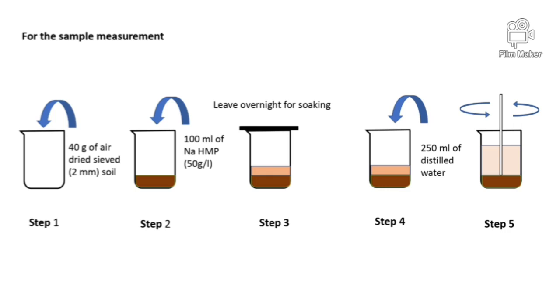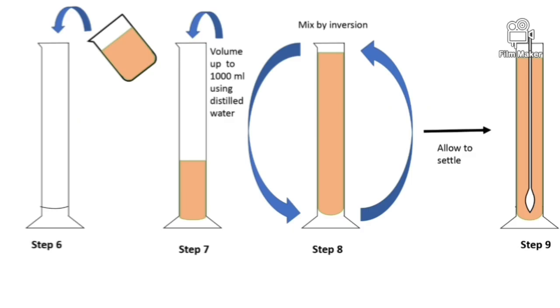Next, add 250 milliliters of distilled water into it. Then stir the solution well. Next, add the soil solution and sodium hexametaphosphate mixture into a 1000 milliliters measuring cylinder and volume it up to the 1000 milliliters mark.